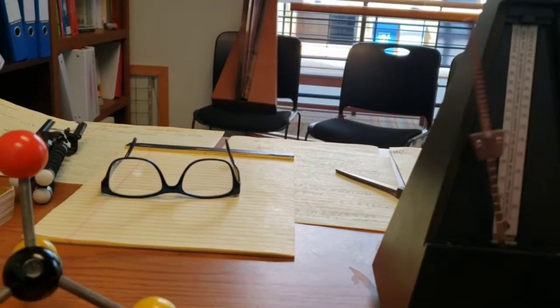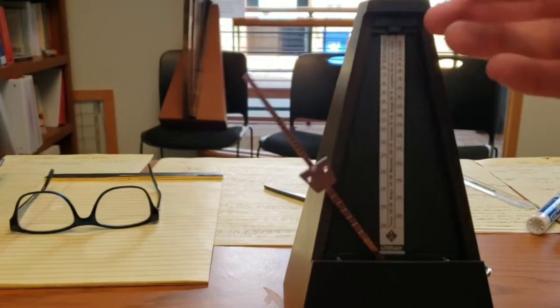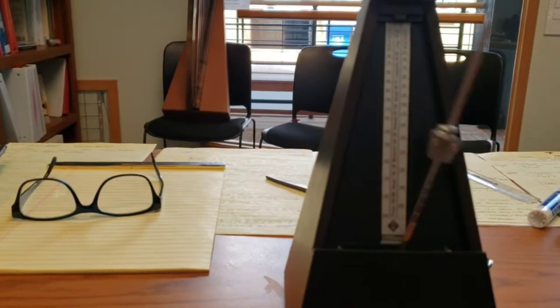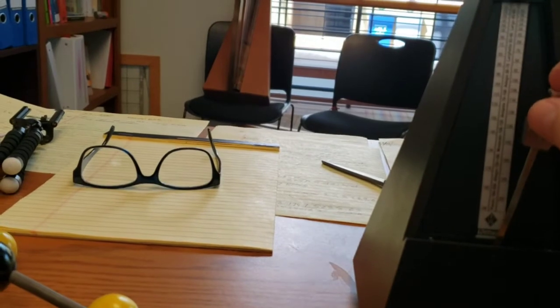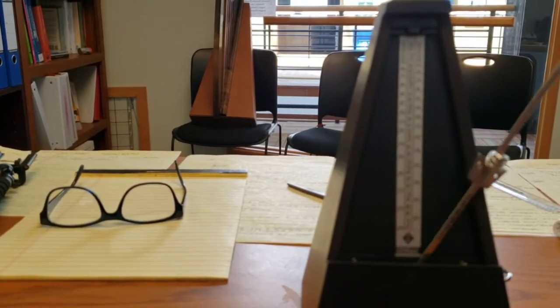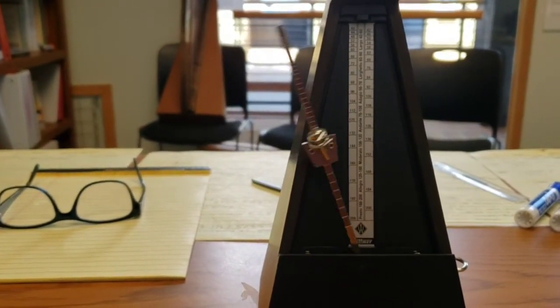Also, adding weight to the metronome slows it down. Bonds to heavier atoms vibrate at lower frequencies.